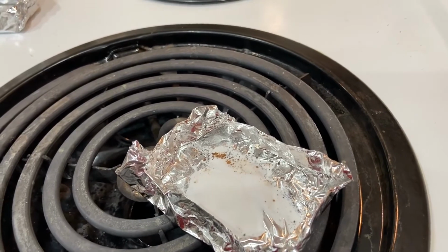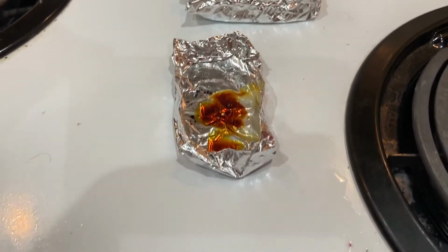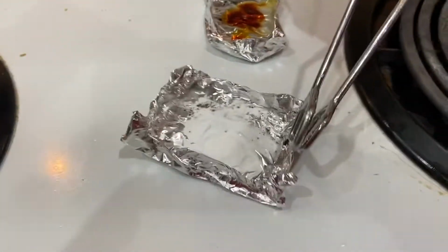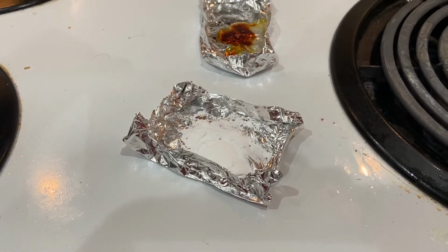So we saw substance C begin melting first, then substance A melted with quite some drastic changes, and then very little change with substance B, no melting, just a little bit of browning. Okay, so that is part 2.